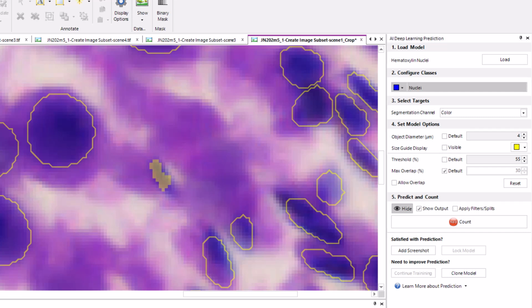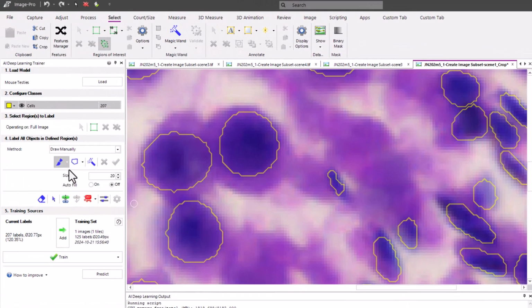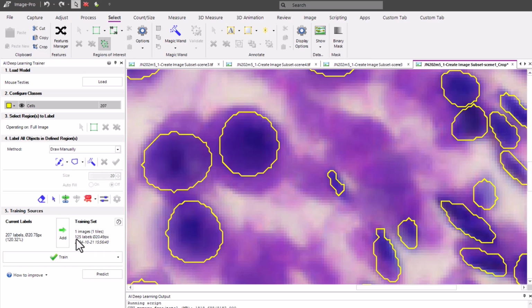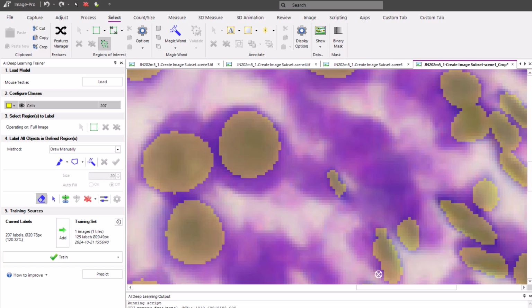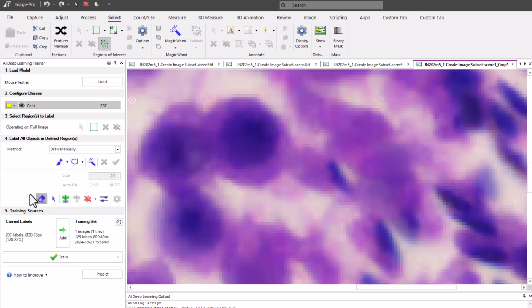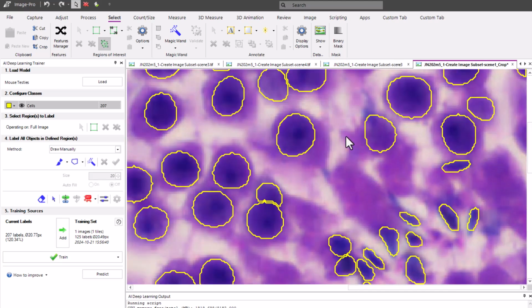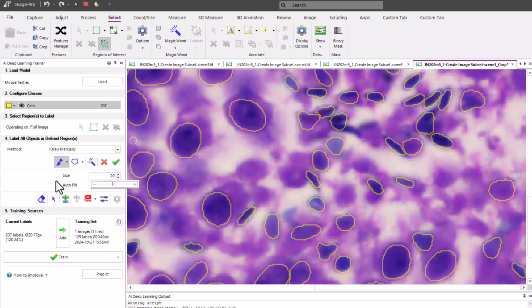And here, let me show an example of the merge and edit. So I'm just going to confirm that one. A couple of things here. If I want to merge and edit, I could simply draw that area in, and I could add that. So when I confirm it, I now have a new outline. And if I want to clean up a little bit, I'm going to take this off first. I can use the eraser tool and confirm it, and then turn off the eraser tool, and then the outlines will be updated.